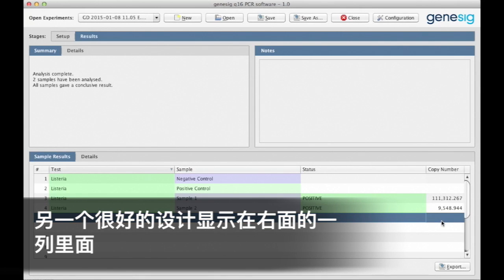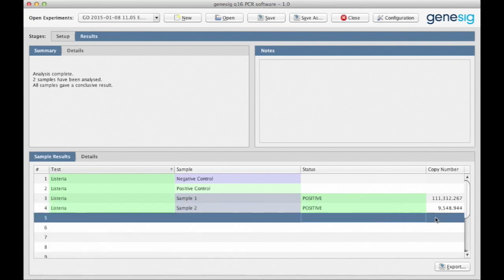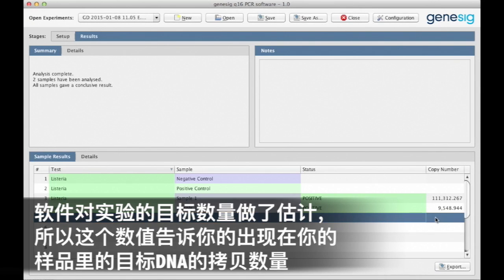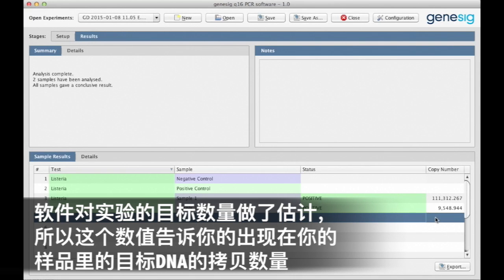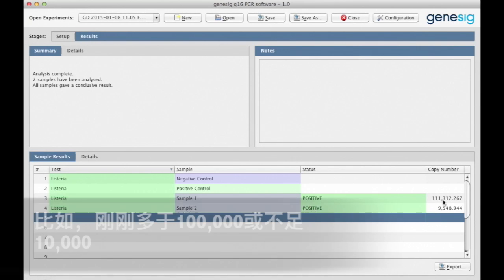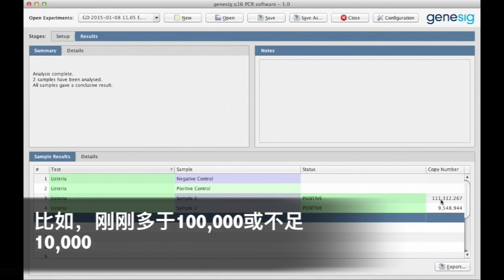Another really nice feature is displayed in the column here on the right. Here the software gives an estimation of the amount of the target that is present. So this number tells you how many copies of your target DNA were present in your sample. So for example here, just over 100,000. And for the second sample, just under 10,000.